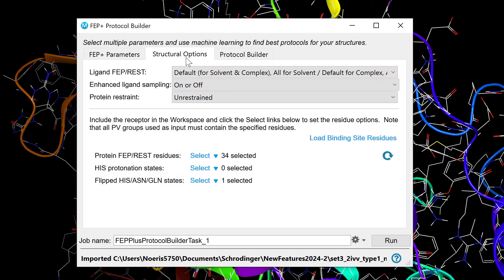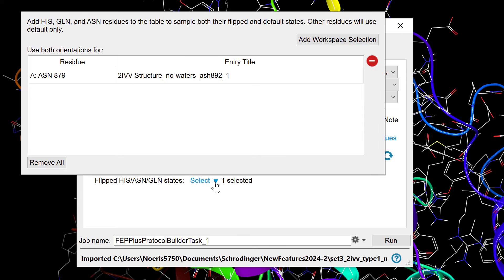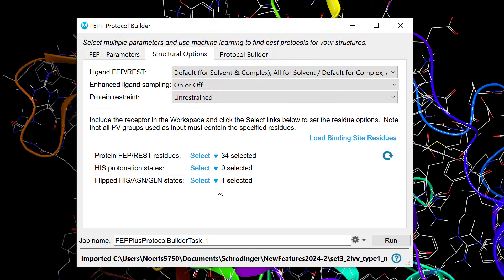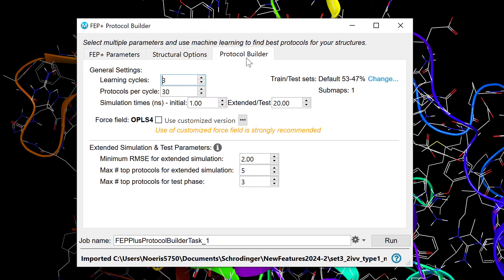Structural options for both ligand and receptors are also customizable, allowing for the determination of rest residues, histidine states, and testing glutamine and asparagine flips. Moreover, the protocol builder settings can be fine-tuned, such as to automate ligand assignments to training and test sets.